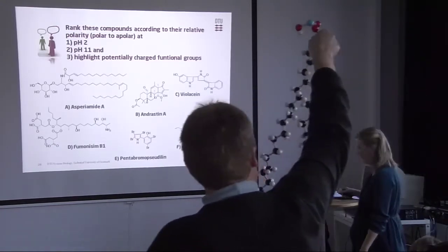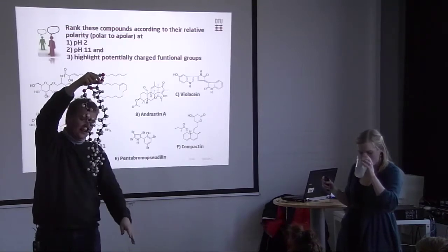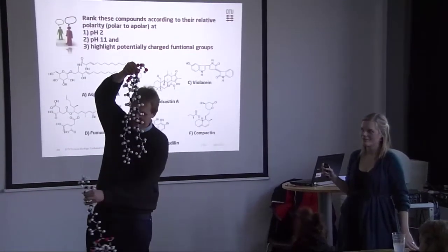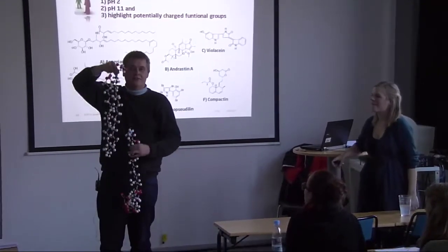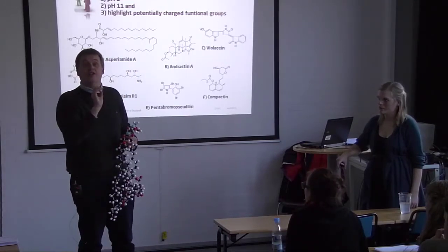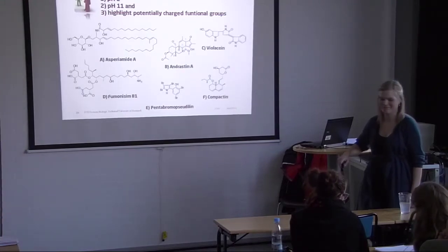But reverse phase is usually the C18 chain. So they're sticking out from the particles and the interaction from your molecules to this is very, very fast. You know, they're moving out here. And the reverse phase is the faster principle here. This is why it's usually the most efficient. So this is where we can really see minute differences with molecules. But we're not able to predict them, not very well, not always.